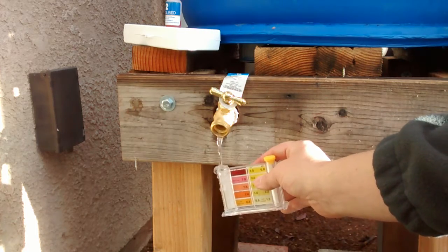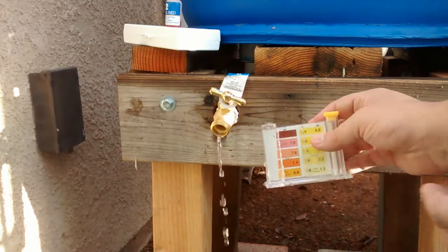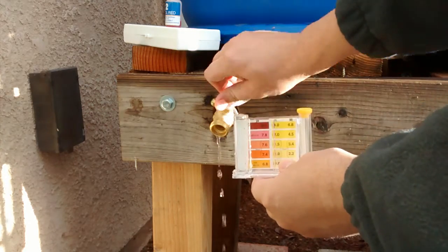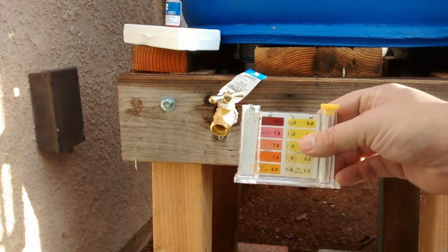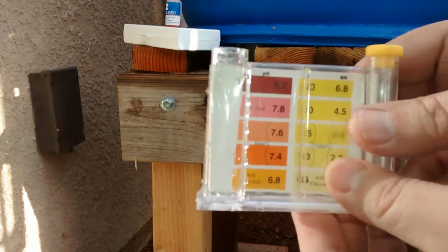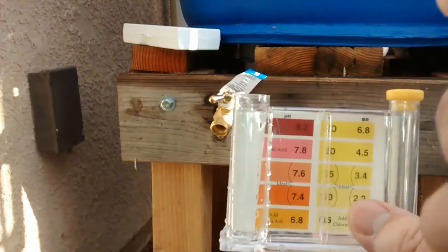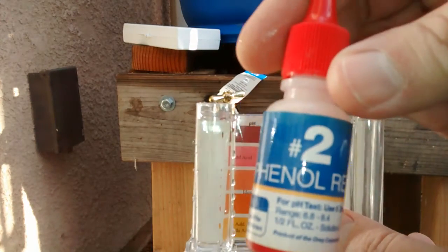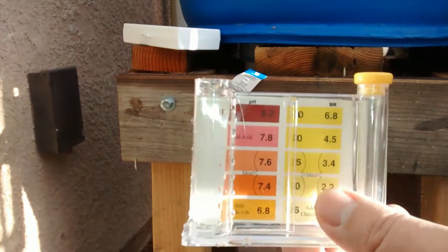Let's dump that out a couple times. There we go. Now I just have to take a little off the top and that's about it. So now what I'm going to do is take the solution.